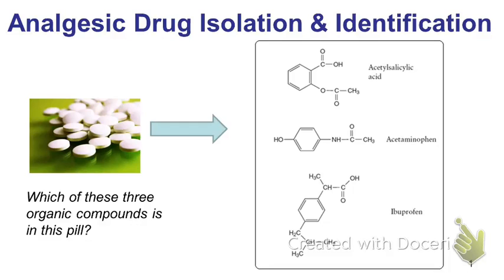You're going to be looking at an analgesic drug. You're going to be given an unknown capsule, and you get to isolate the drug inside it and purify it to roughly the best of your abilities. Okay.